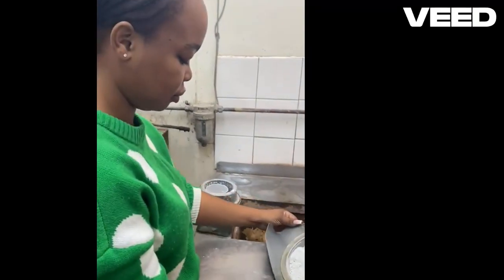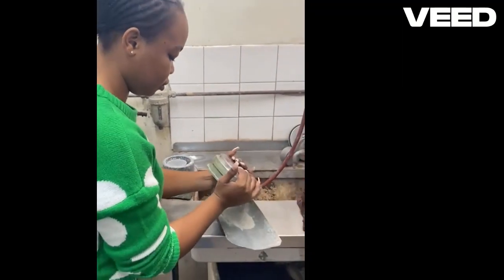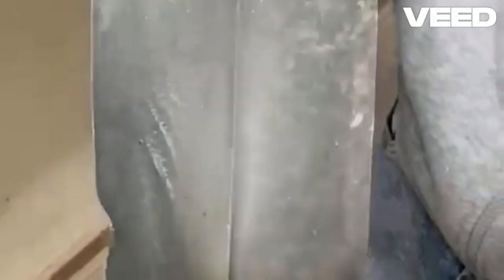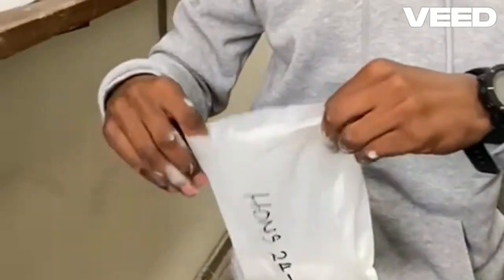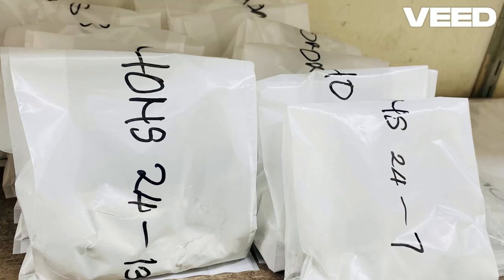The pod is collected and placed somewhere away from water or any contaminants. However, you must clean and spray the tray to avoid contamination. The powder is then safely placed into a tray that will easily allow the packaging into a sample bag. The powder is then stored in the labeled bag, same in labeling as the initial core sample. The bagged powder is stored in a certain order.